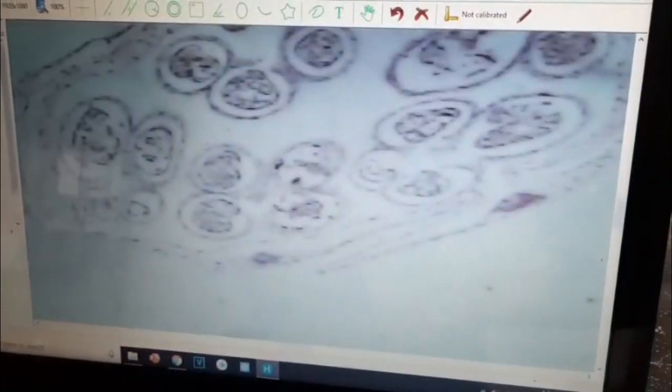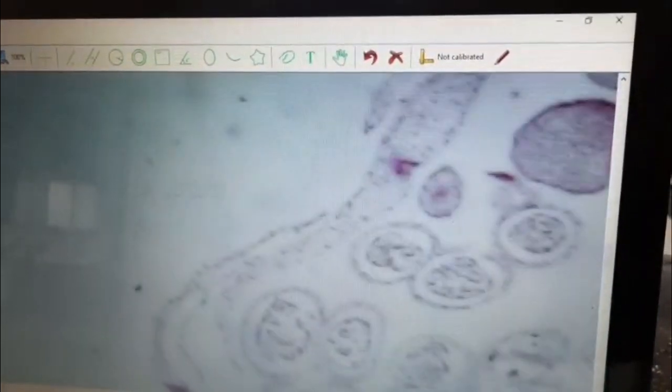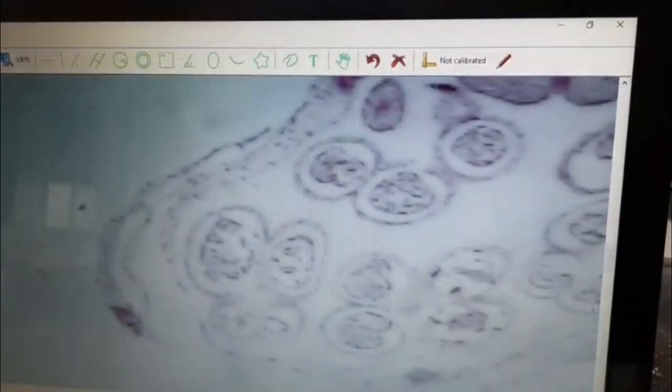I'll show you one more slide — meiosis metaphase one. It is a cytology smear where you can see the black threads instead of the nucleus. This is the real stained material. I'm taking a snap of this as well. Let me adjust the focus and take the snap.